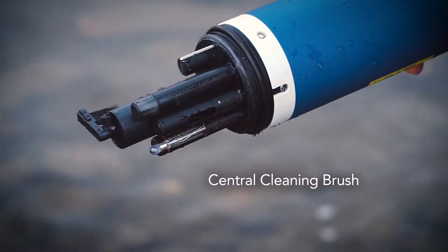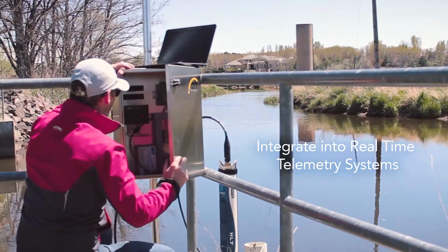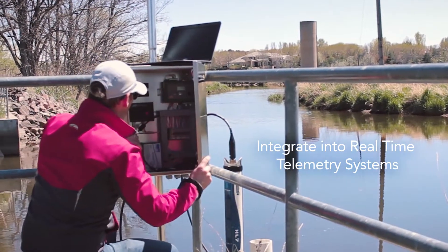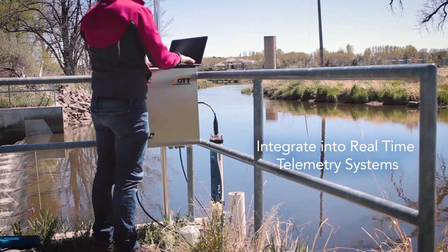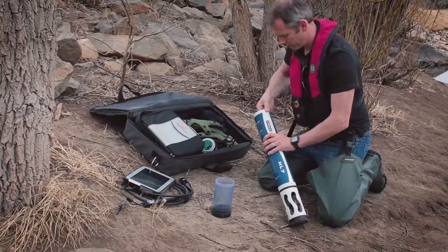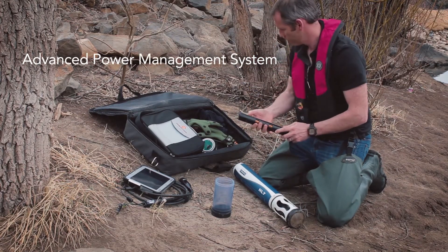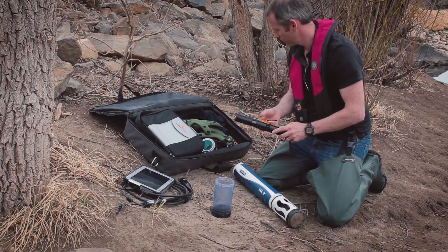Minimize biofouling with the central cleaning brush. Log data internally and easily integrate into real-time transmitters and data loggers such as an OTTnet DL or Sutron SatLink 3, and take advantage of the improved advanced power management system.